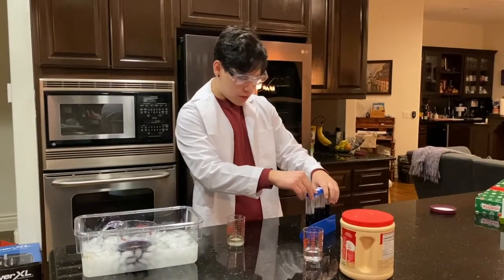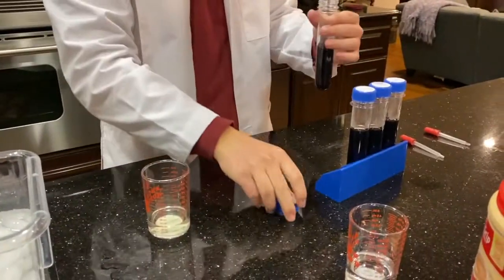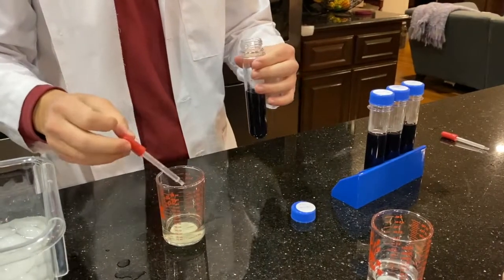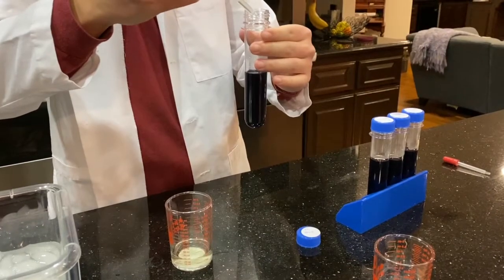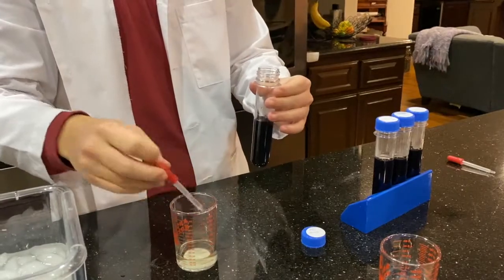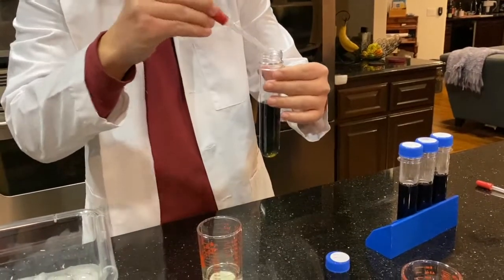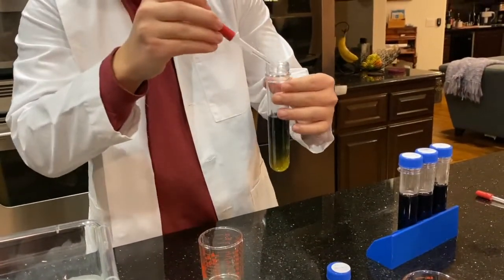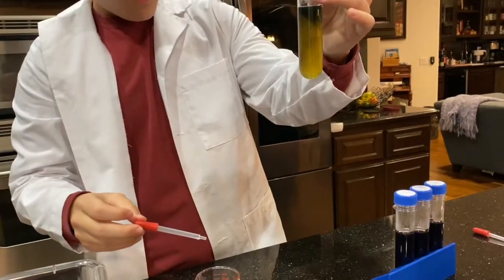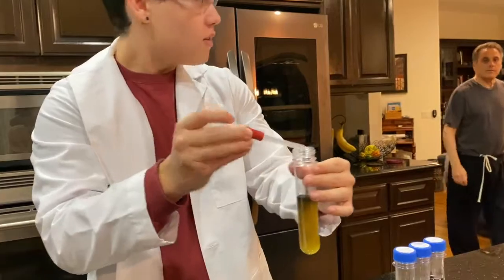Now is the moment of truth — we're going to do bleach first. We'll take a few drops of bleach and see if it does anything. Remember, this is basic, so it should turn a bluish color from the purple. It just looks black at first — actually kind of funny. Let's put a little bit more in. Oh — did you see that? It actually turned yellow! It turns yellow. Do you see this?